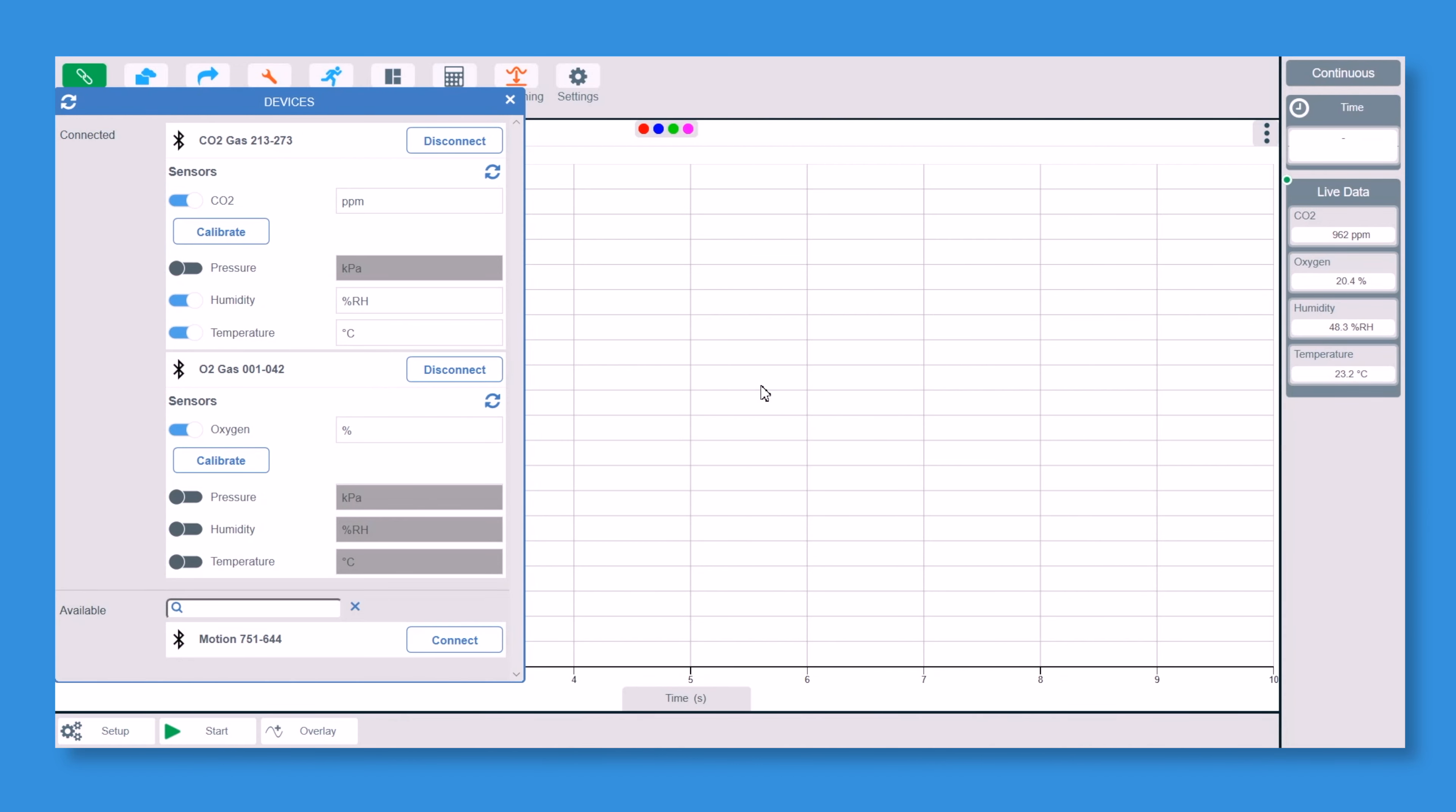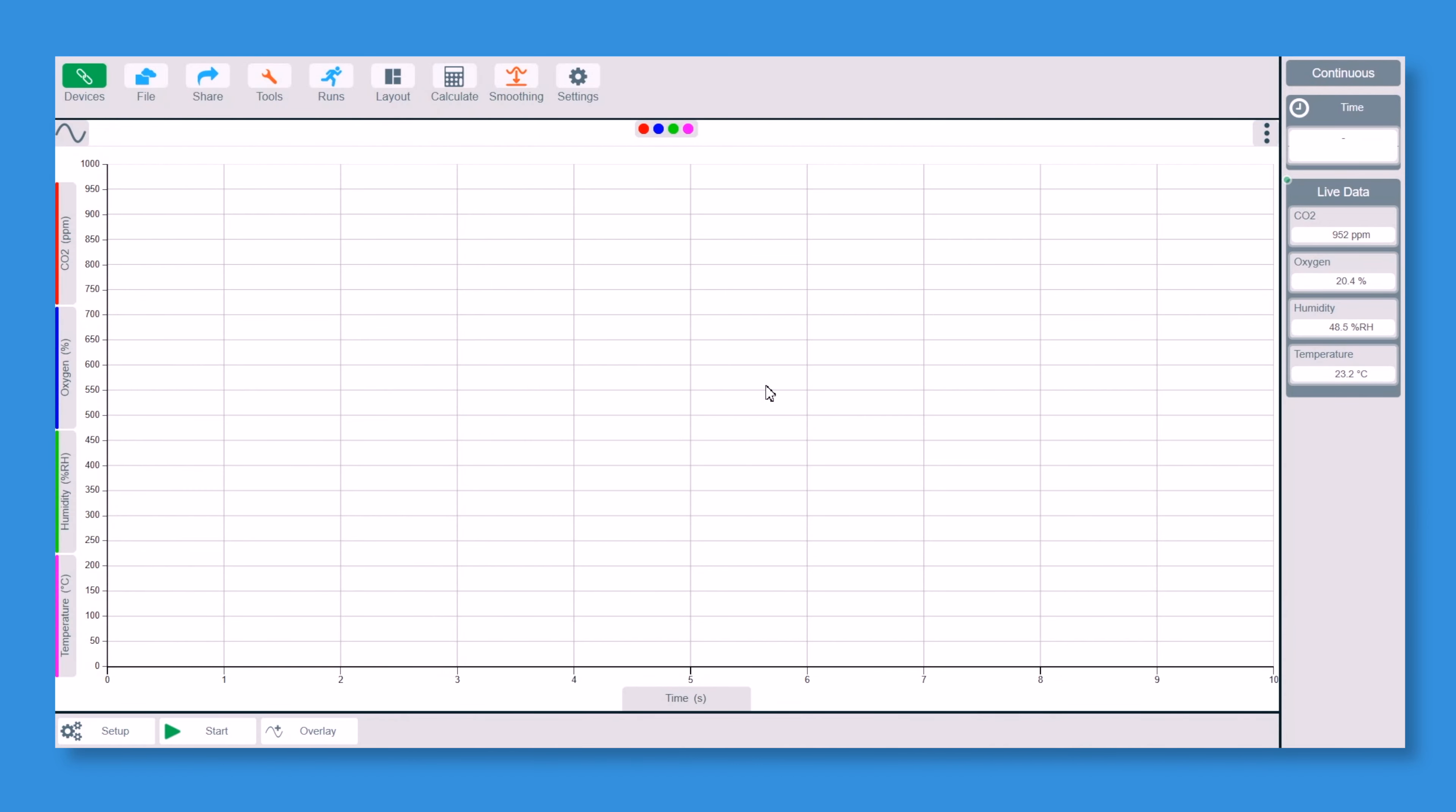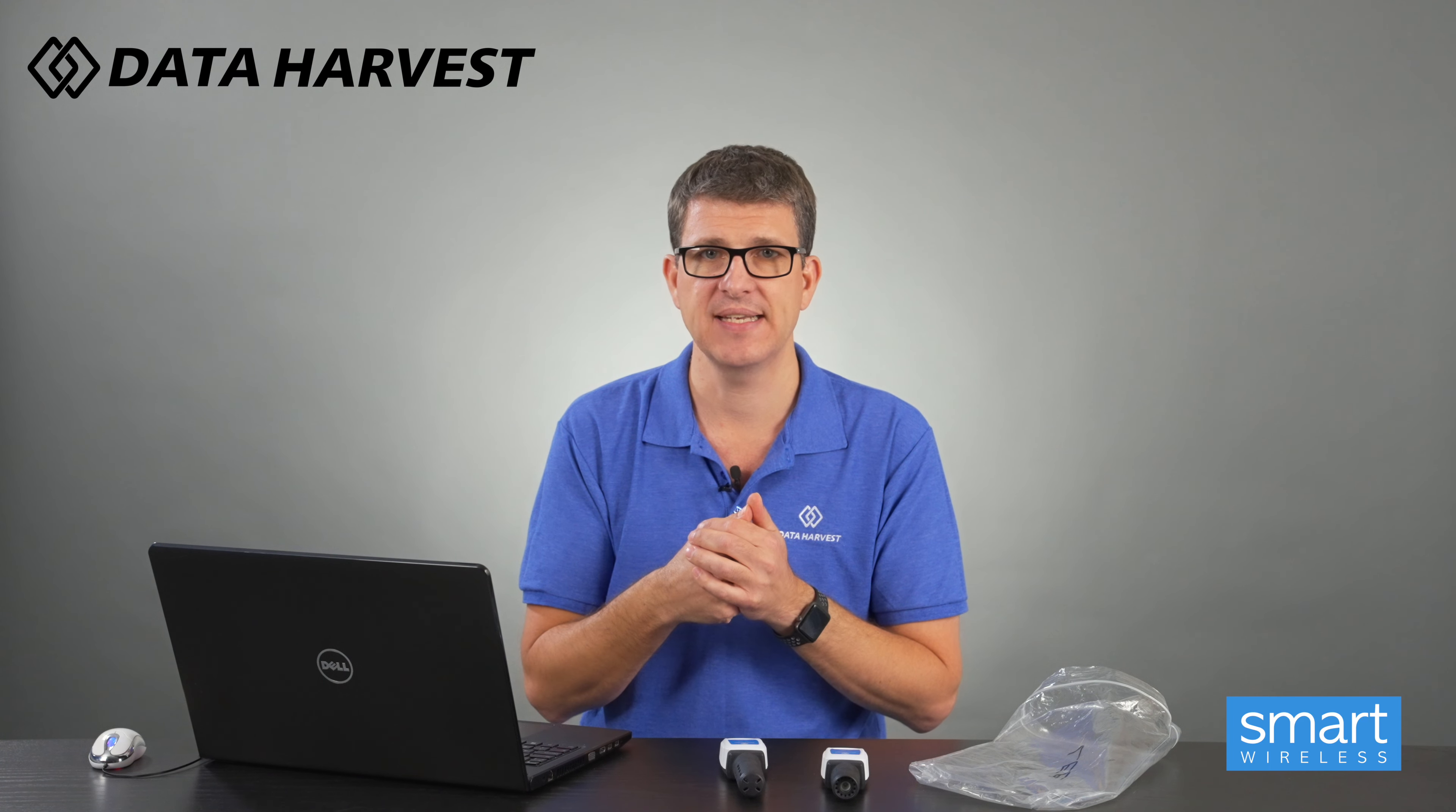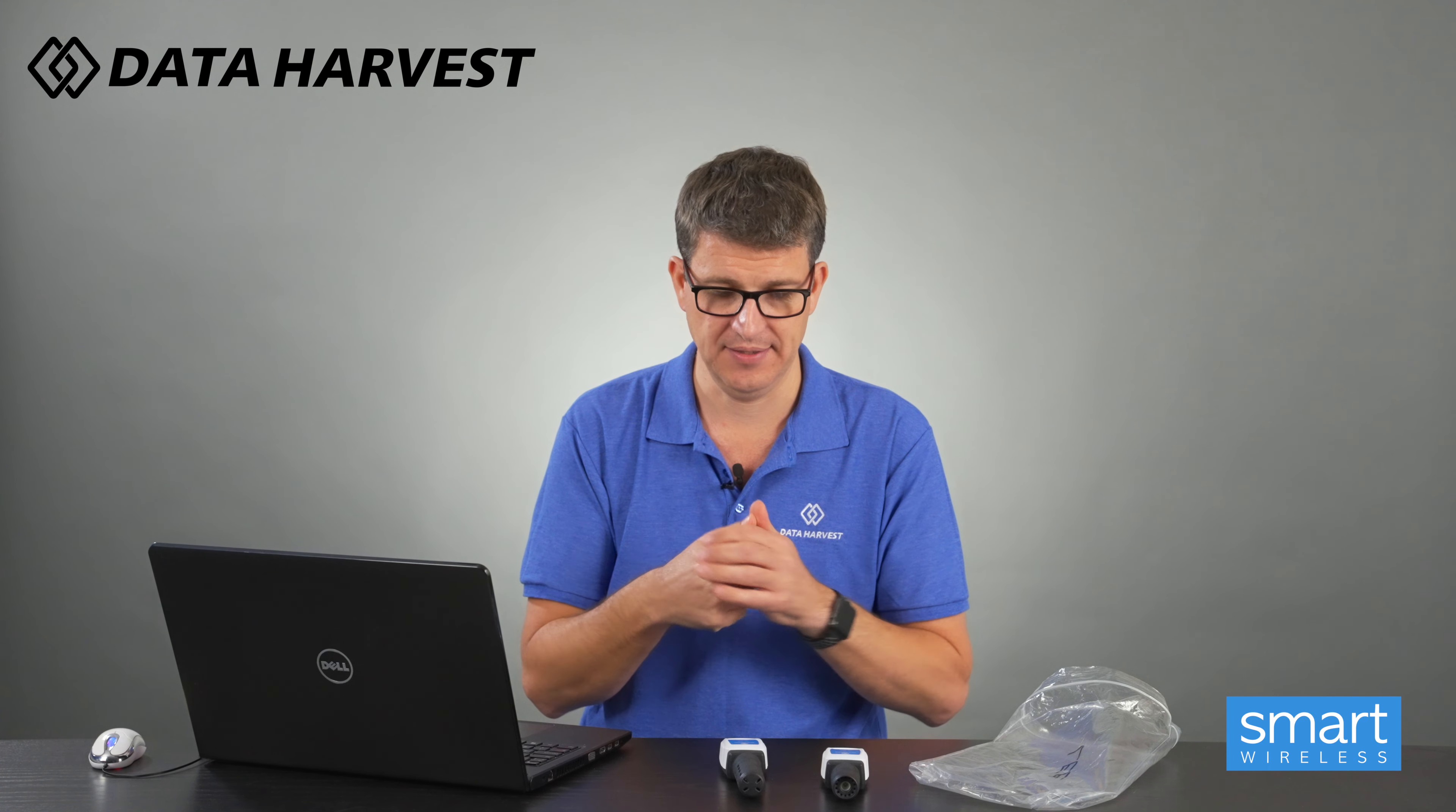Now there's a couple of different ways you can actually show this experiment today. So to start off with, I'm just going to leave it as it opens up, collect the data and then show you the different ways that you can display that data and then we can analyse that accordingly.